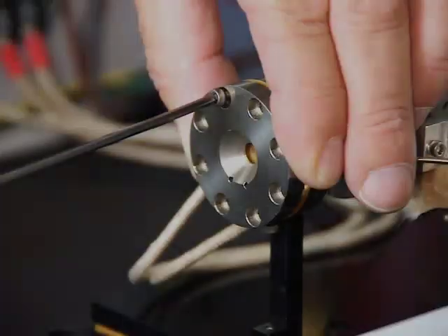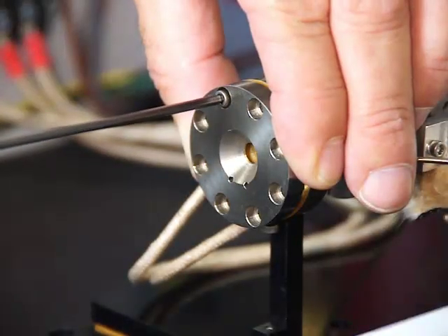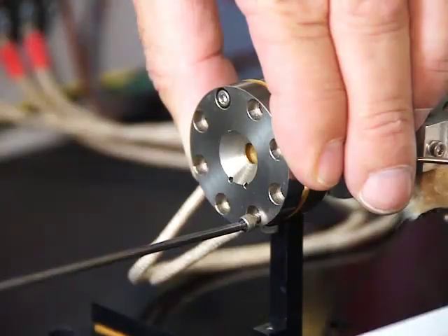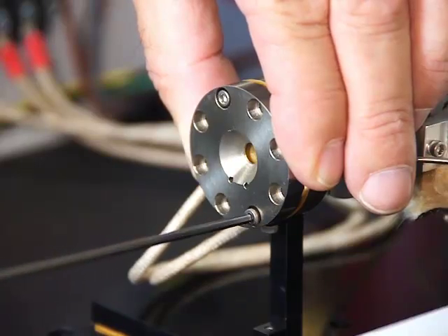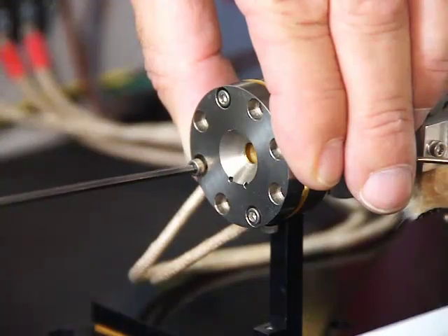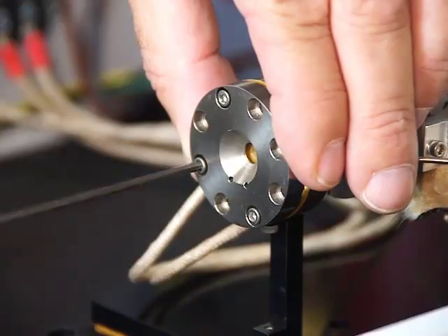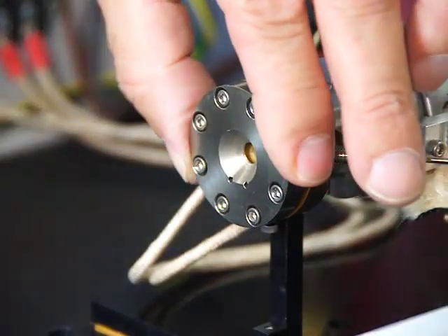Secure the end cap in place with one of the top screws. Continue assembly by adding screws at opposite sides of the cap. Install all screws loosely and allow play within the cap to remain.